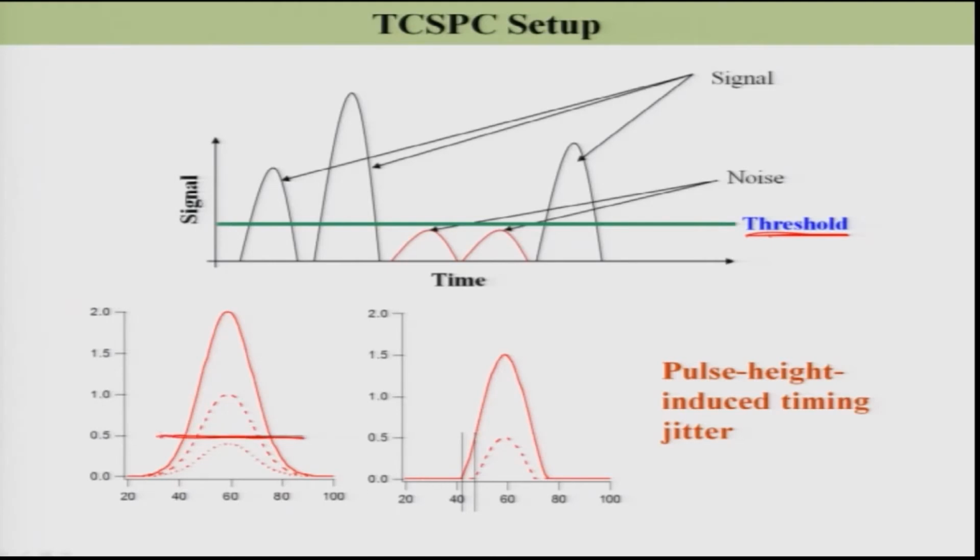So, here in this axis, this is the start time of this signal, the big signal, and this is the start time of this small signal.